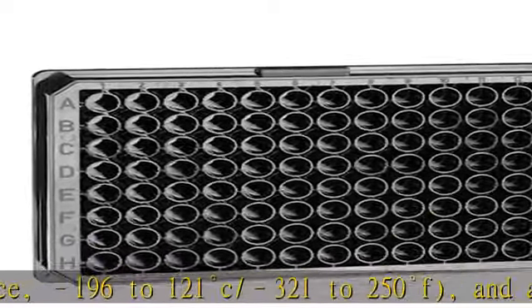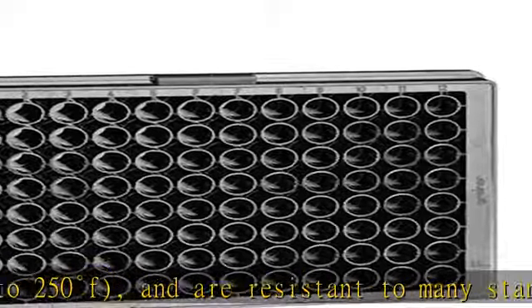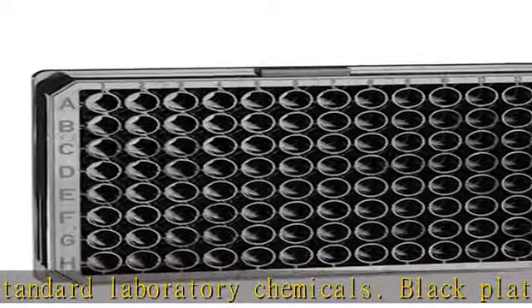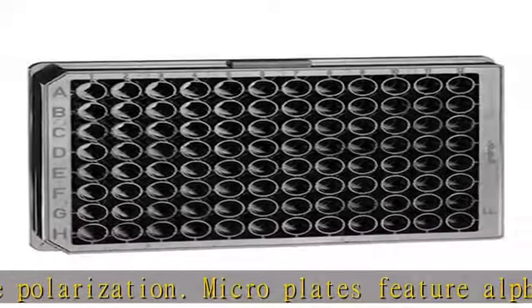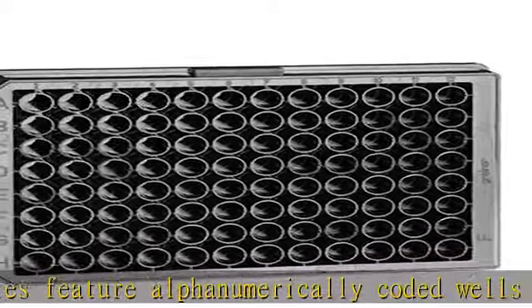Stackable and autoclavable plates are supplied without lids. Dimensions: 128mm L x 86mm W x 15mm H. Plates are free of detectable RNAs, DNAs, human DNA, and pyrogens. All plates have a footprint conforming to the ANSI/SLAS January 2004 standard. Visit the description to get this product today at the best price.